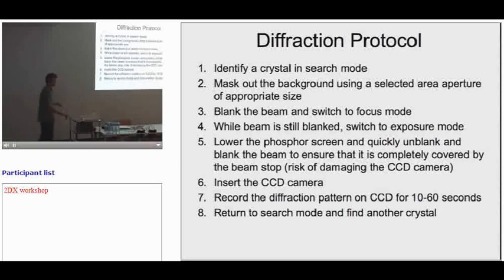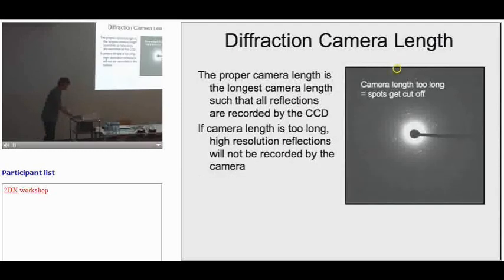The greatest advantage is that you immediately have your diffraction pattern. So as soon as you finish taking the diffraction pattern, you have your image. You know if it was good or not, which lets you quickly determine, is this a good grid, is this a bad grid? So you can quickly switch out a bad grid without having to spend two or three hours looking at it. And you also know, is this a better area? Is this flat enough? Should we move to another grid square?